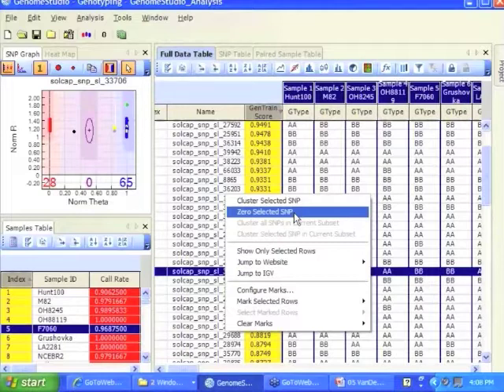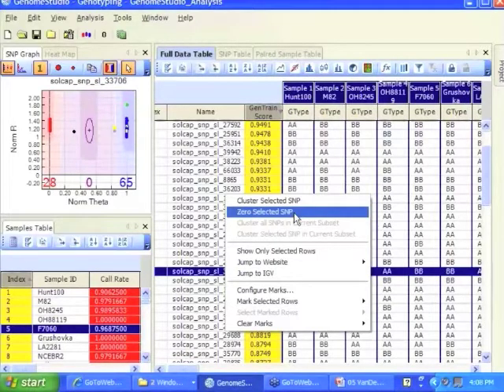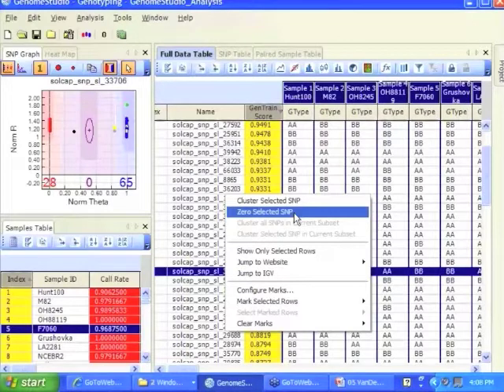So that's where there is some hands-on things where I think you're going to have to look into the data a little closer. So you can choose to zero different SNPs and zero different samples based on how good or bad they look.